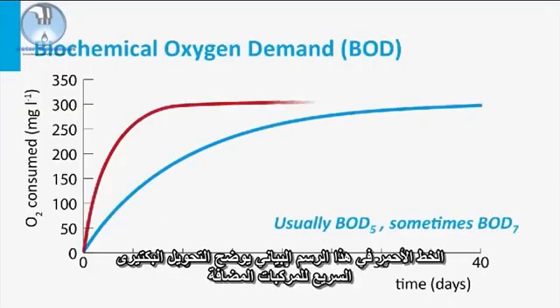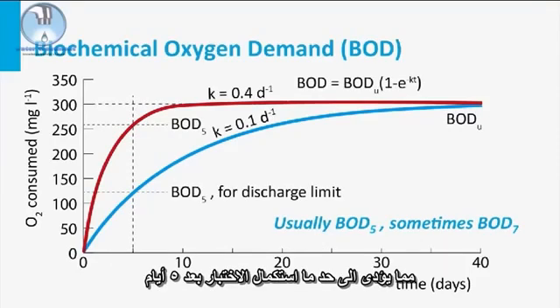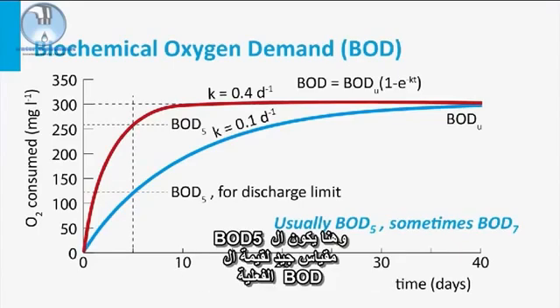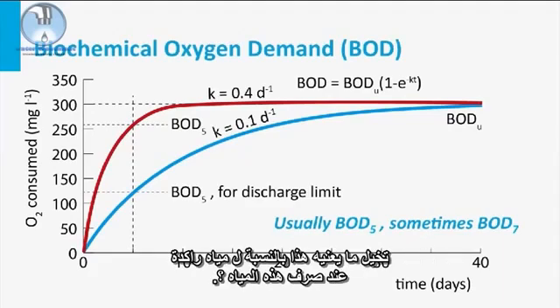The red line in this graph shows a rapid bacterial conversion of the added compound, resulting in a more or less complete test after 5 days. The BOD5 is here a good estimate of the actual BOD value. However, the test result of the blue line at day 5 severely underestimates the actual BOD value. Imagine what this means for a stagnant water body when we discharge this water.